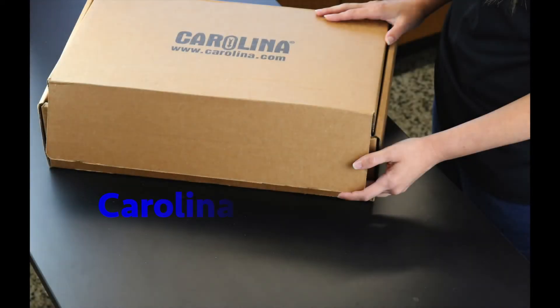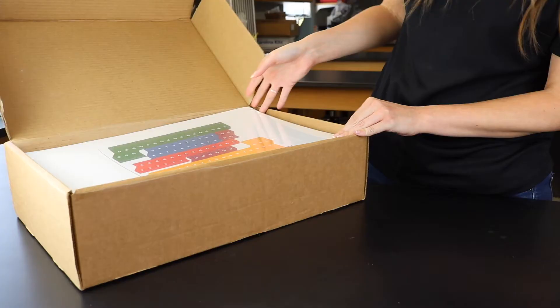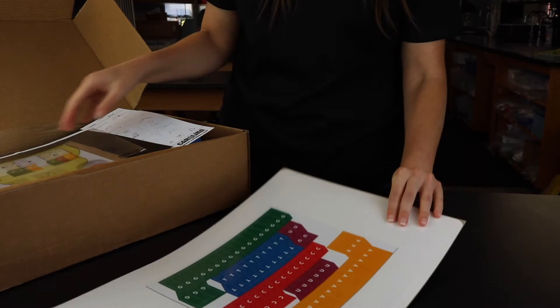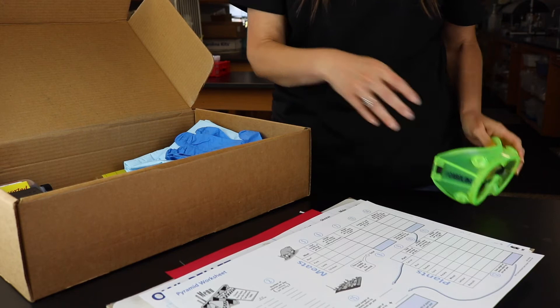Carolina Biological Supply Company is answering the call for remote science instruction during this unique time of school disruptions and the need for social spacing in high school classrooms. We would like to introduce you to Carolina Kits 3D Flex, the country's first year-long biology and chemistry lab programs for home and in-school socially distanced learning.